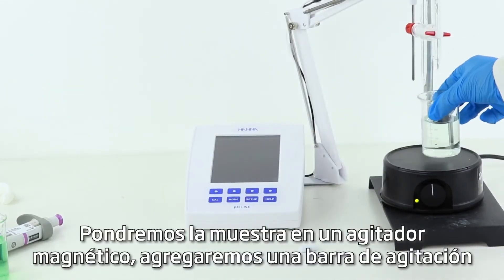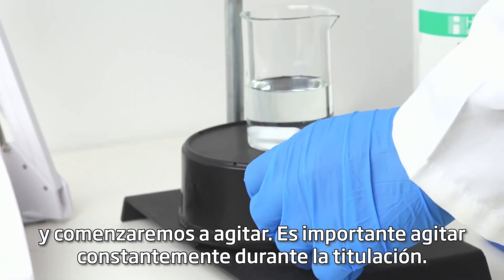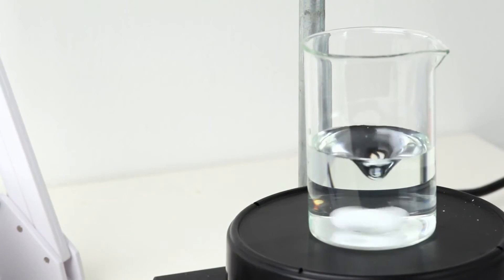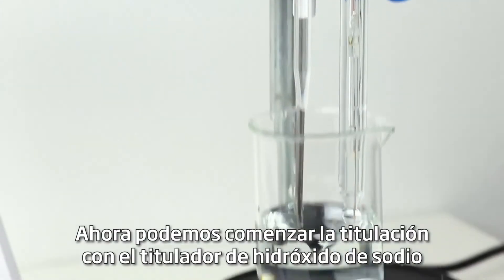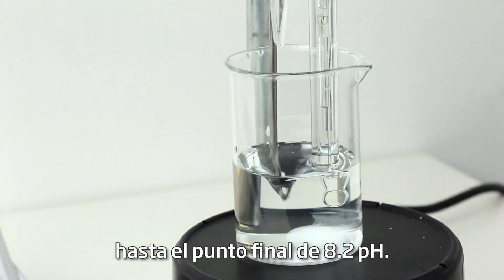We'll put the sample on a magnetic stirrer, add a stir bar, and begin stirring. It's important to constantly stir throughout the titration. Now we can begin titrating with the sodium hydroxide titrant to the endpoint of pH 8.2.